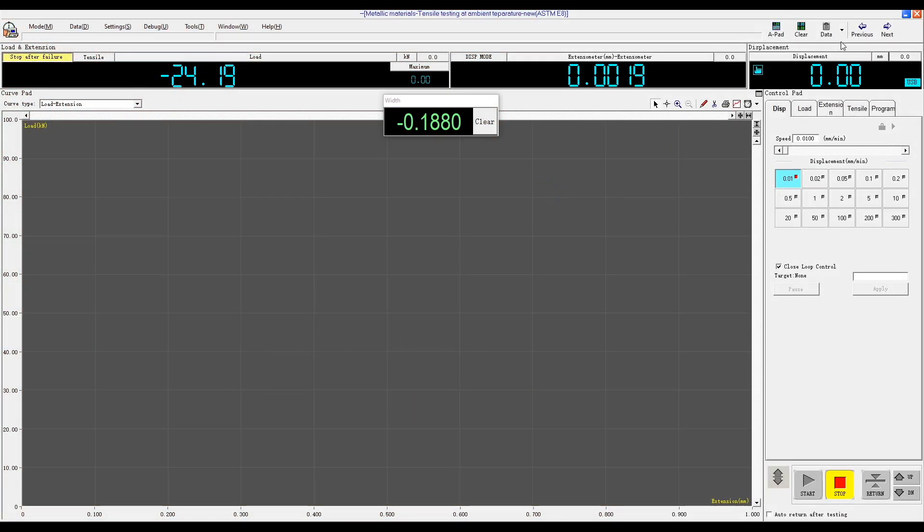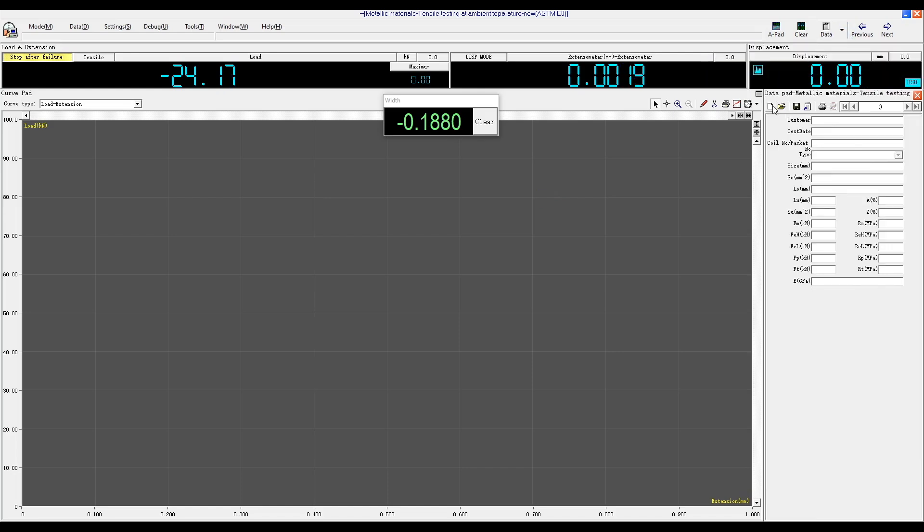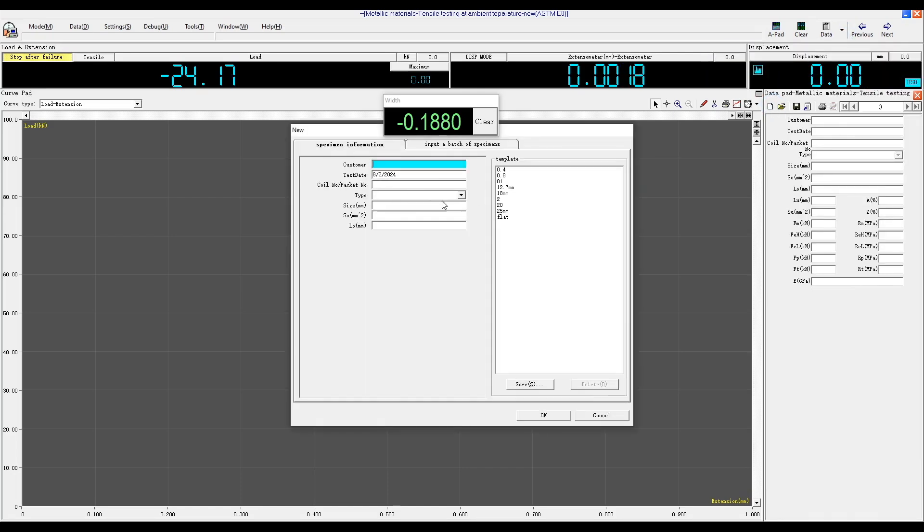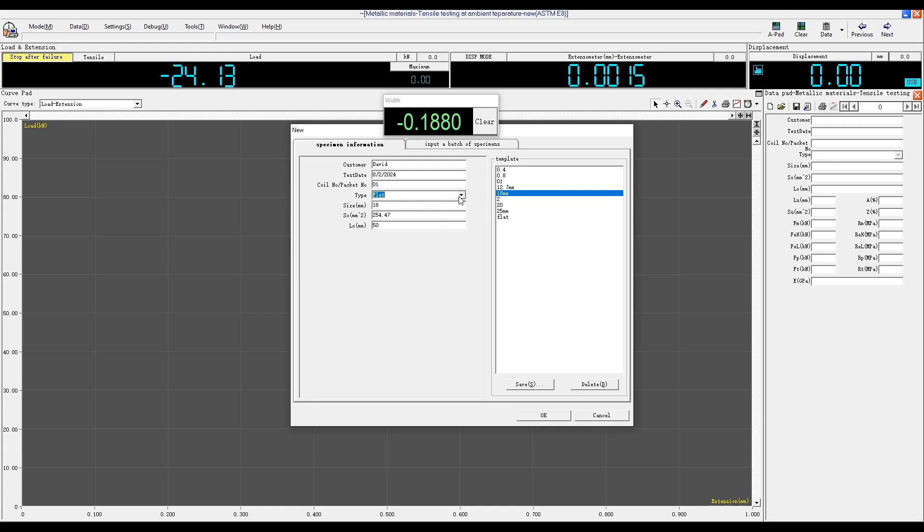Performing a tensile test with a clip-on extensometer. First select a test standard, in this case ASTM E-8, then click New to input the sample information. The sample type for round specimens is indicated as circle, while flat specimens are indicated as flat.